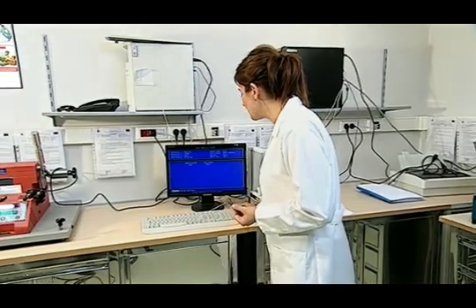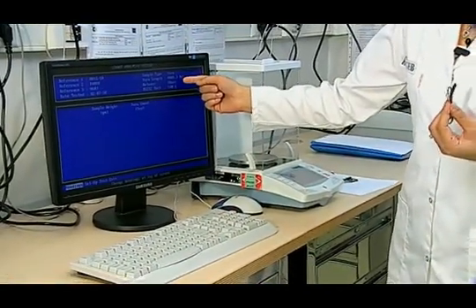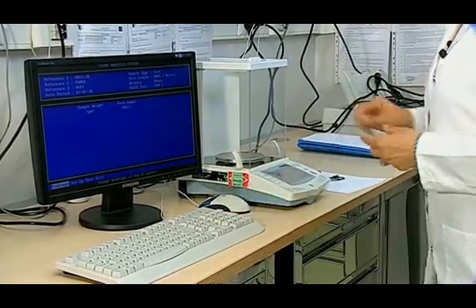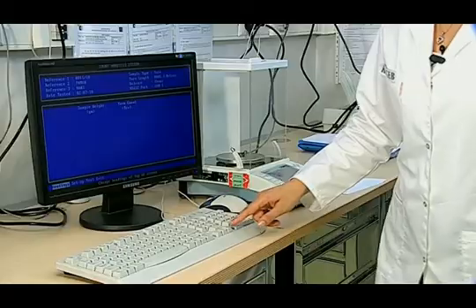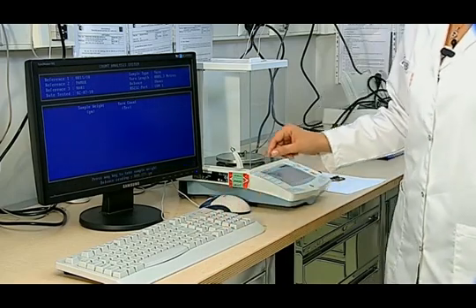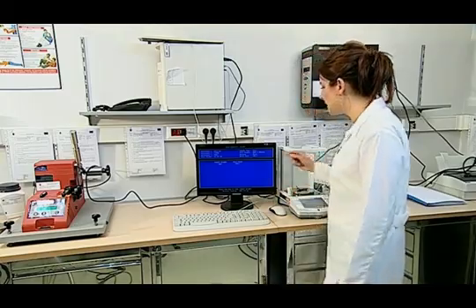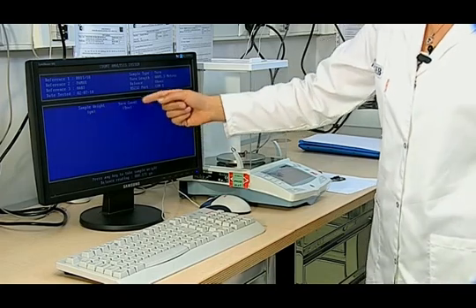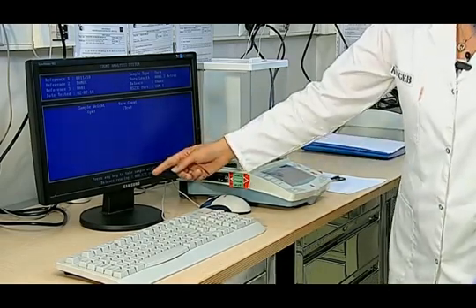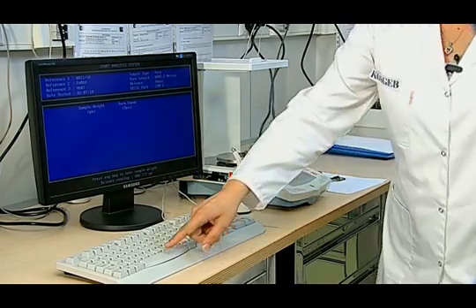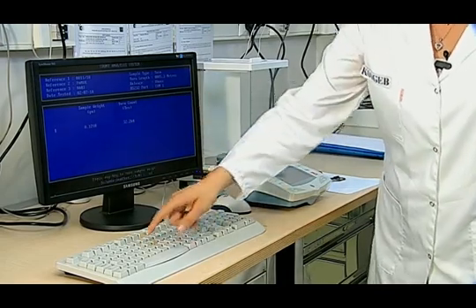To have it done, the sample's data is put into the computer program. The yarn's determined length, i.e., 53 cm, is multiplied by 10. The result of the multiplication is put into the computer program. We go into the testing process after the screen is reset. In this computer program, the TEX number, denier, metric number, British and French numbers are automatically calculated. The sample's weight and number have already been determined in grams and TEX respectively. The output on the screen is automatically passed to the computer program, and it translates the weight to the respective yarn number. After accepting this sample, we weigh five samples of the weft and warp directions.